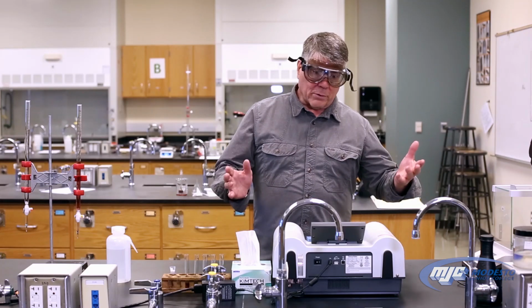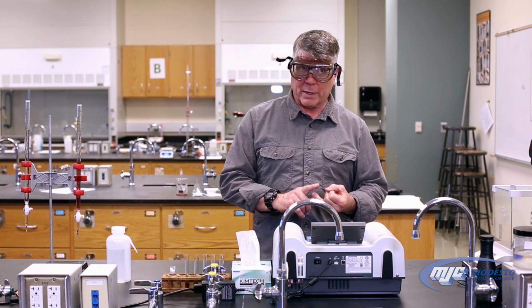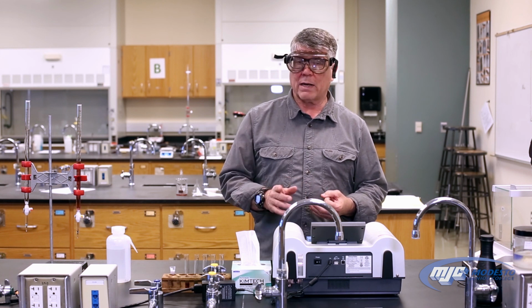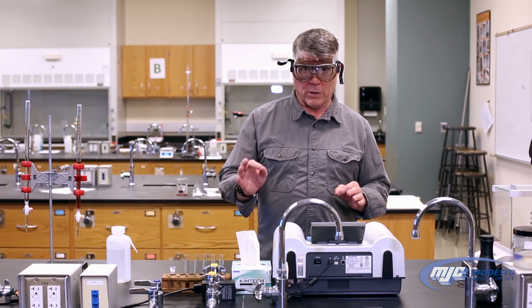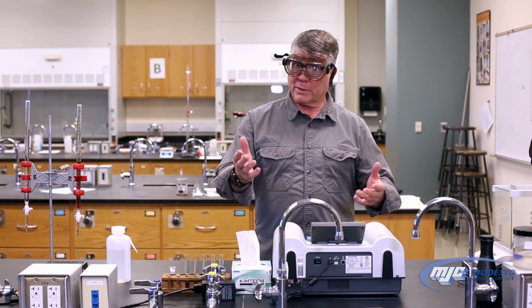All right, guys, so now that we have the Lambda Max for cobalt, the Lambda Max for copper, the absorbance for solutions 1 through 5 for both cobalt and copper, as well as the absorbance for cobalt and copper of the unknown solution, we have all the data we need for the experiment. We're finished. That's all there is to it.